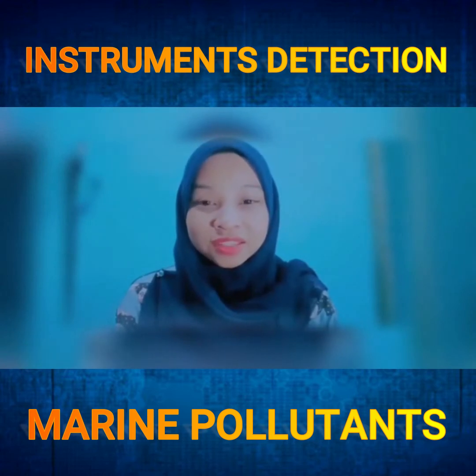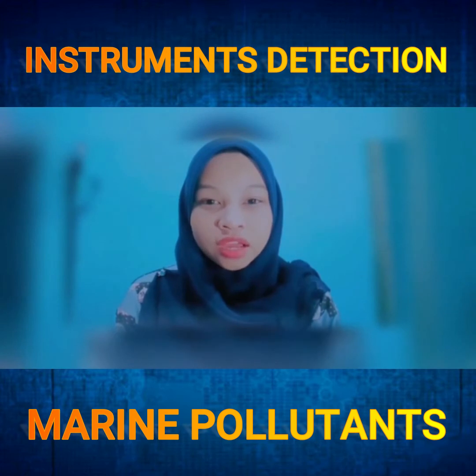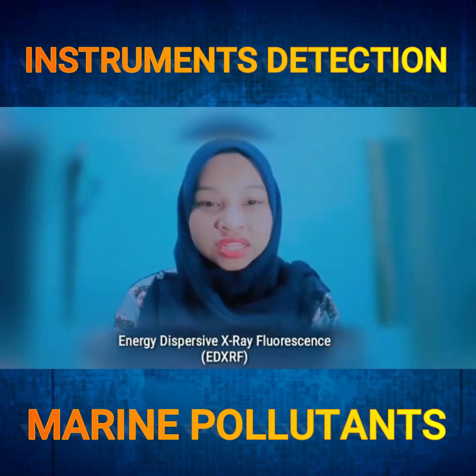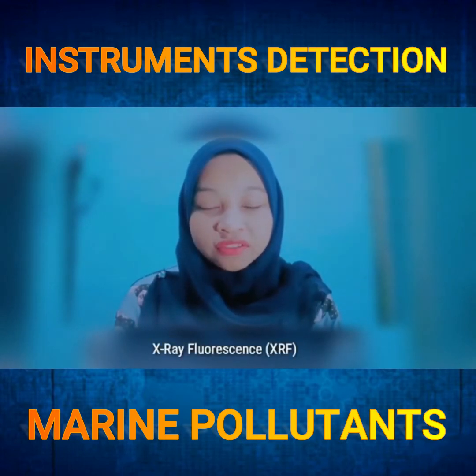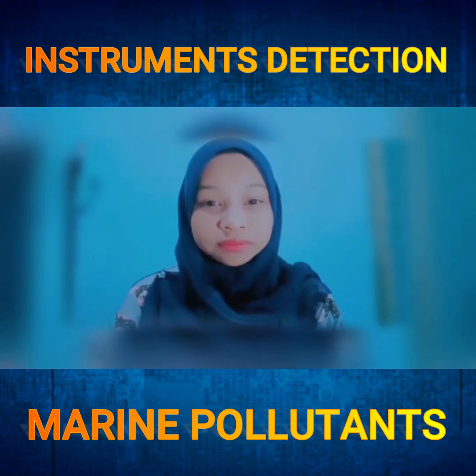Okay, the instrument that I choose is Energy Dispersive X-ray Fluorescence, or EDXRF. So, how does it work? Energy dispersive X-ray fluorescence is suitable for determination of matter in marine sediment. EDXRF is designed to analyze a group of elements simultaneously. This type of XRF instrumentation separates the characteristic X-rays of different elements into a complete fluorescent energy spectrum, which is processed for qualitative and quantitative analysis.